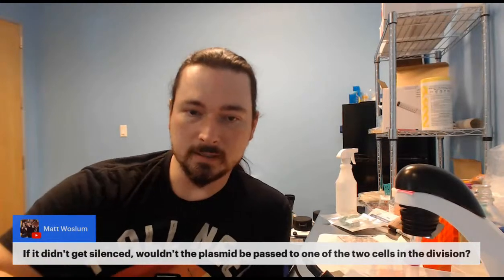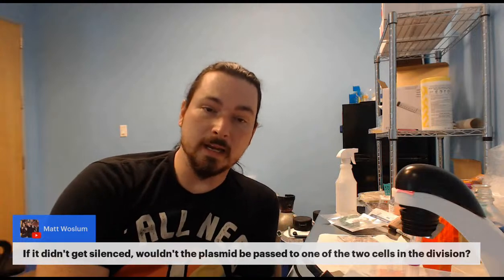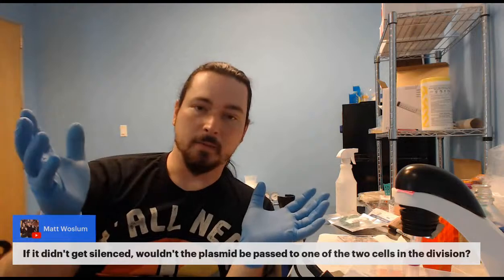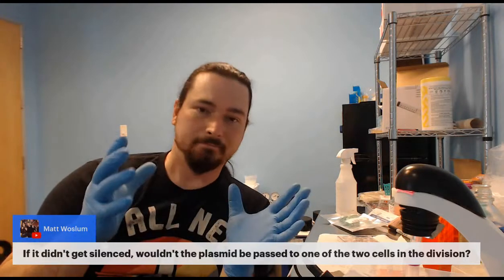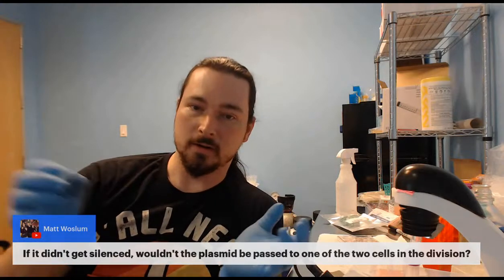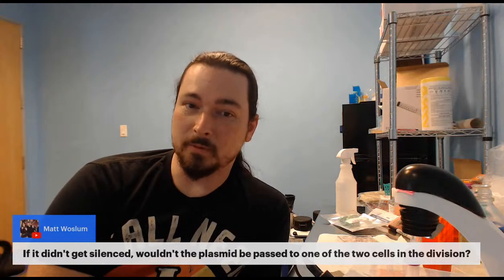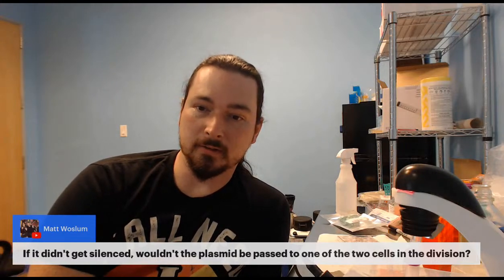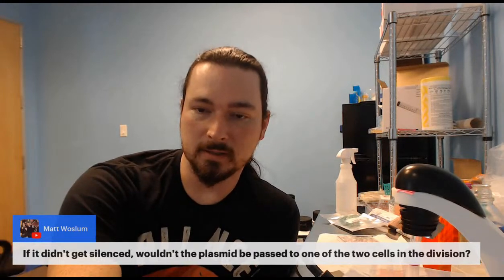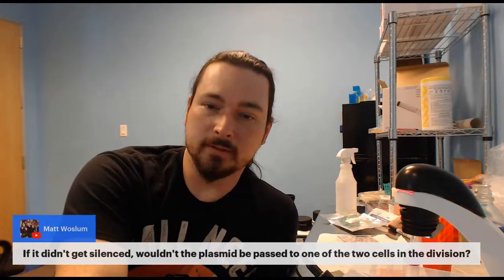So if it didn't get silenced, wouldn't the plasmid pass from one of the cells to the next? It's not just one plasmid. Lots and lots of plasmids are going to end up inside any given cell. Whatever your cell is, you'll have maybe 300 plasmids in it. It'll be kind of random. And then when it divides, maybe you get like 150 in each, and so on. Eventually you will get down to where there's maybe one left if you continue to expand the culture. But there's more than one, so it doesn't usually present a problem for at least the first 2 days of replication.